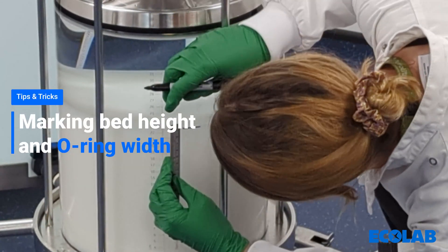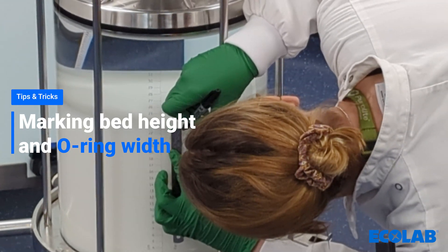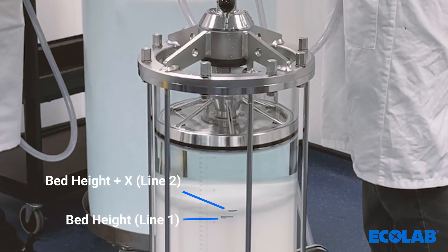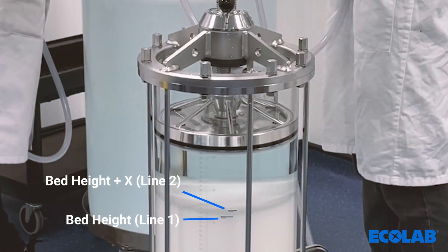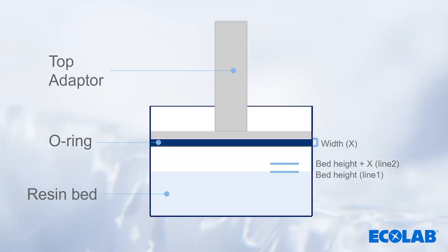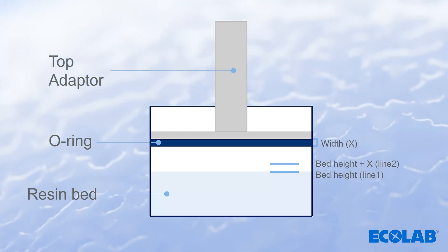Once the bed has stabilized, mark the bed height on the column. A useful tip when packing is to mark a second line above the target bed height, which corresponds to the distance between the bottom of the column head and the bottom of the O-ring. This can make it easier to discern when the target bed height has been reached and avoid over-compression or under-compression of the bed.